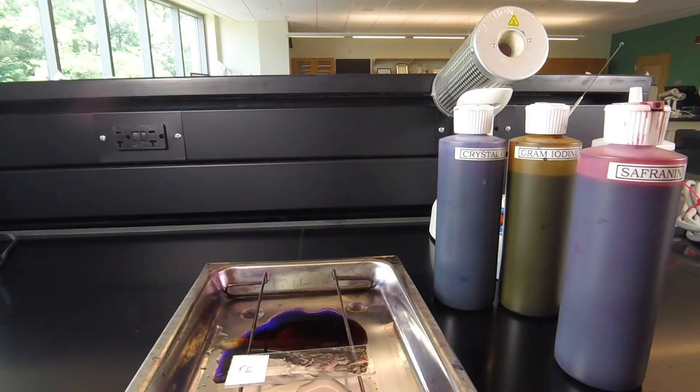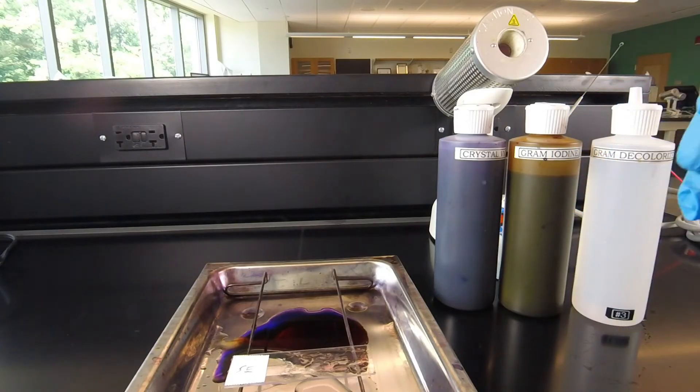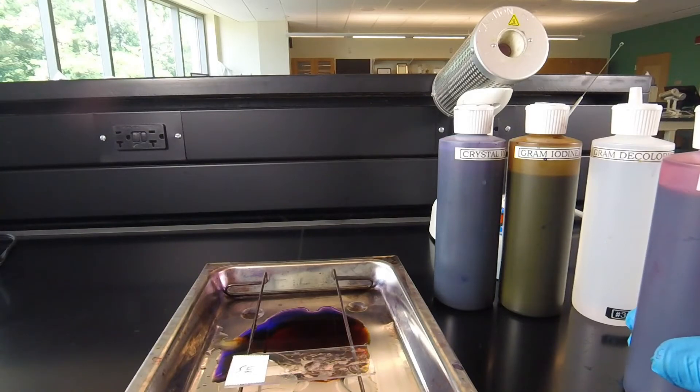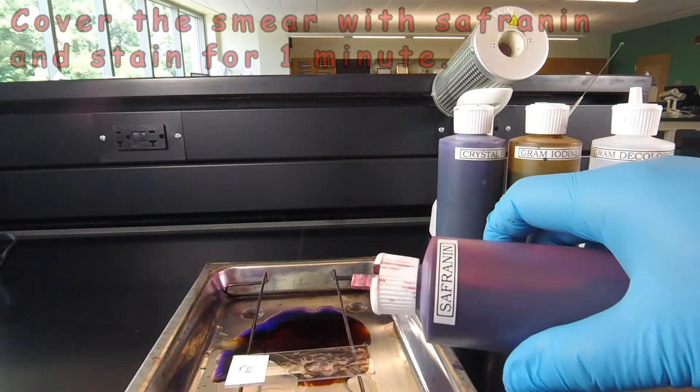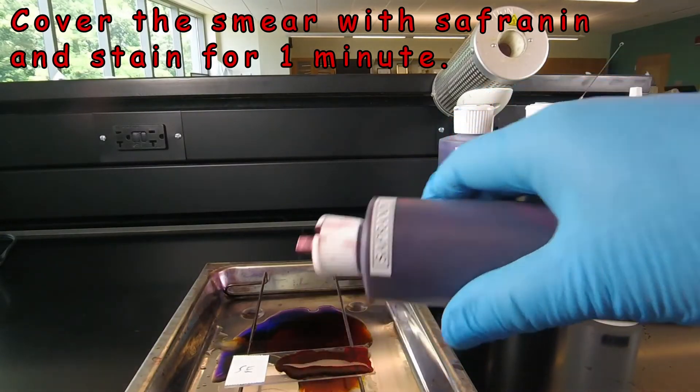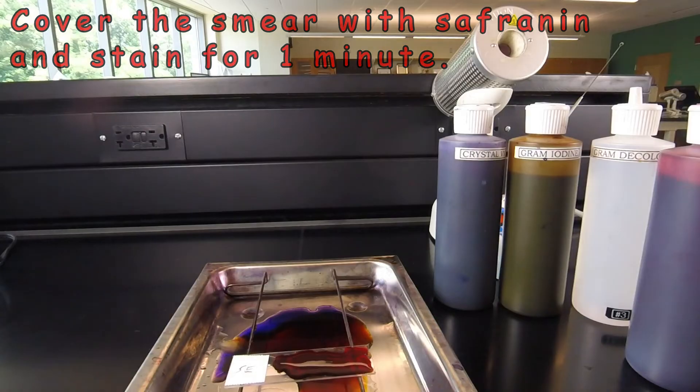In the final step of the Gram stain, we're going to add the counter stain Safranin. It's a basic dye like crystal violet, but it's pink rather than purple. We add enough Safranin to cover most of the smear, and we're going to let that sit for one minute.